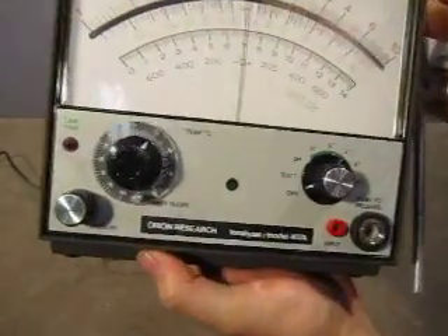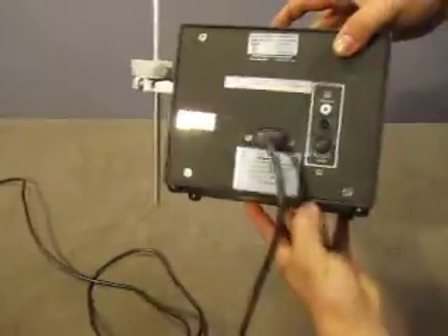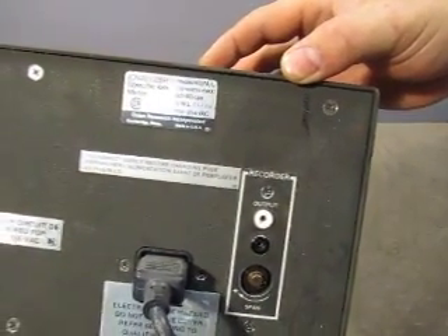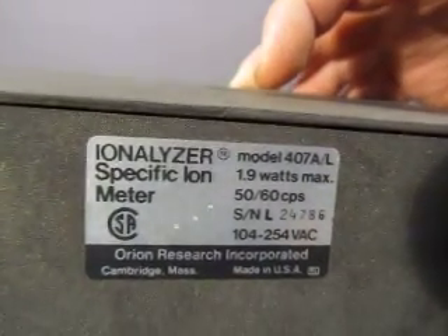It has a power line, temperature, input, and some other stuff there. This is all you get — just the power cord with this. It's model 407A/L, so there's the information — you can read that.